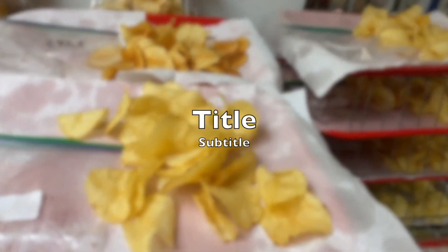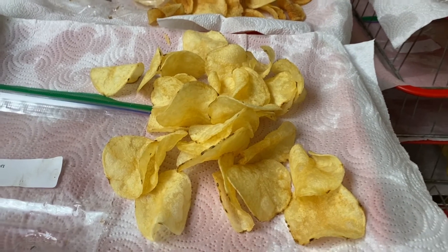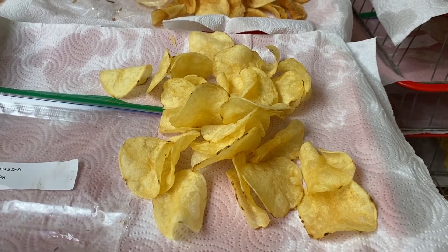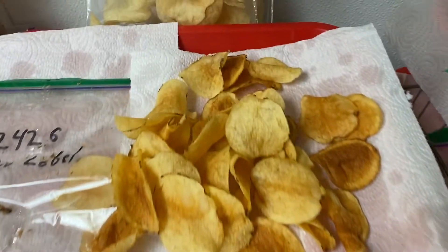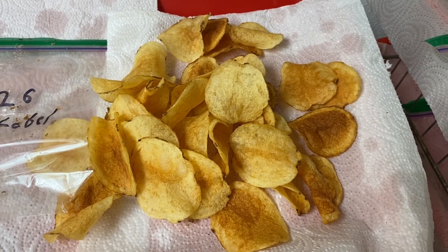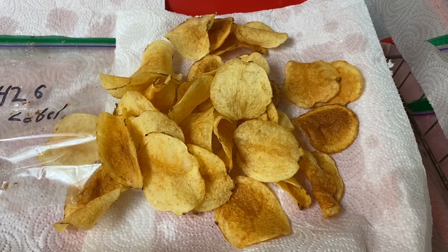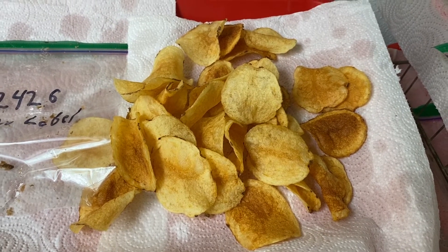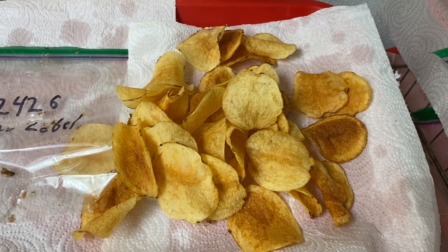Just by looking at those chips — this sample's fry color looks nice, just like the chips we buy from the grocery store. Comparatively, look at this one — we got some very dark color on some of the chips. That means there are high sugar level problems in those tubers, so they will not be acceptable for commercial use.